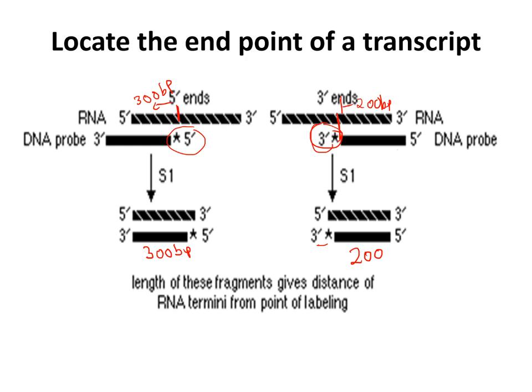And make sure that this region must extend, so that it remains single stranded.